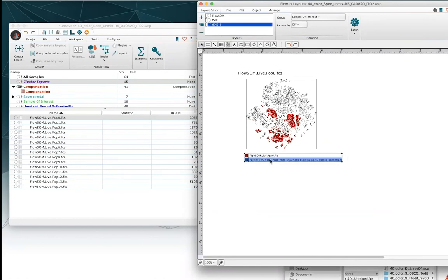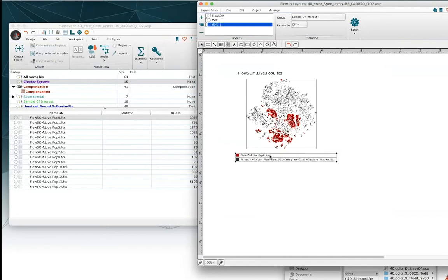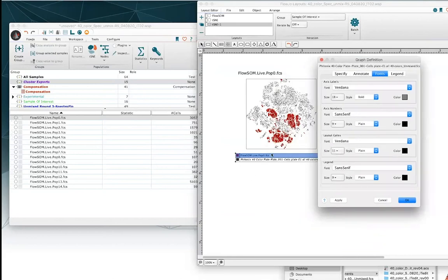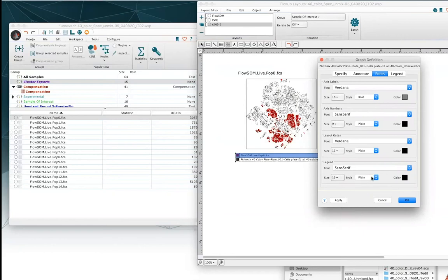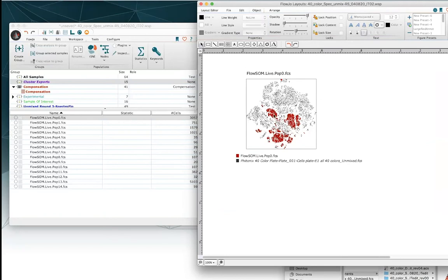Next, we need to make sure that our background population stays static. This is essentially a way to help a certain population avoid the iteration settings — right-click on that population and choose set as control. You'll see that population becomes italicized because it will now be treated as a control. I'll make this legend a little bit larger and the fonts a little bit larger too. If you double-click, you'll get to the graph definition window where you can update your legends to be size 12 in Verdana font. I'm also going to change the object line to none so it shines through nicely, and move the annotations so they're a little bit more aligned.